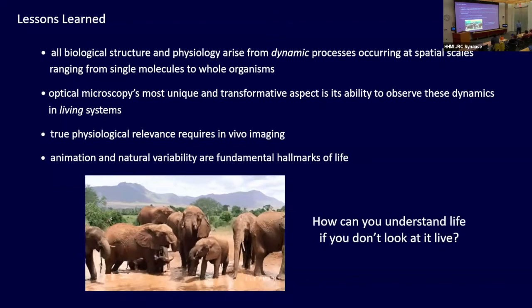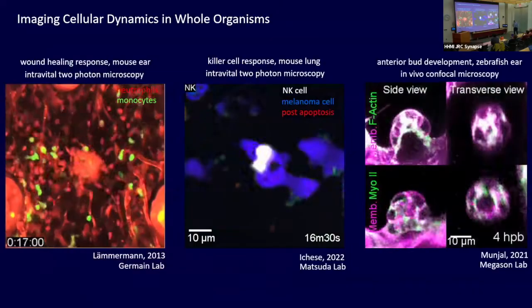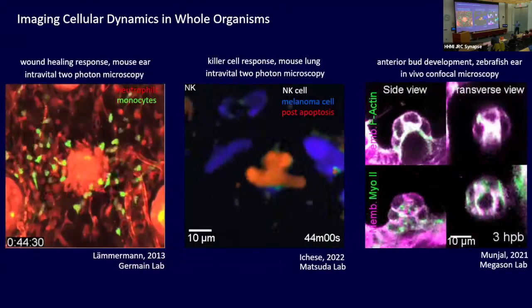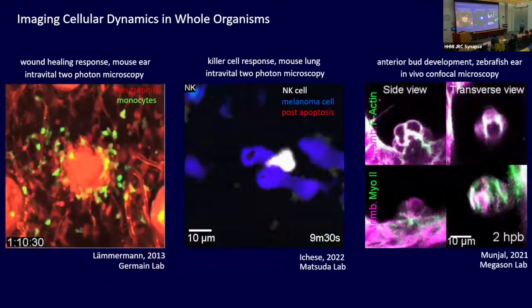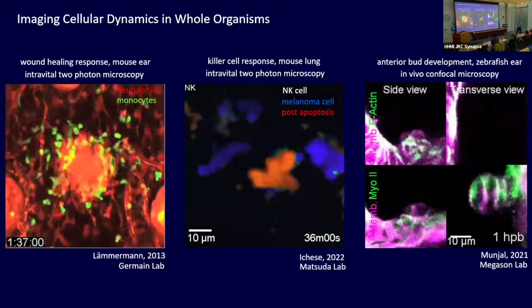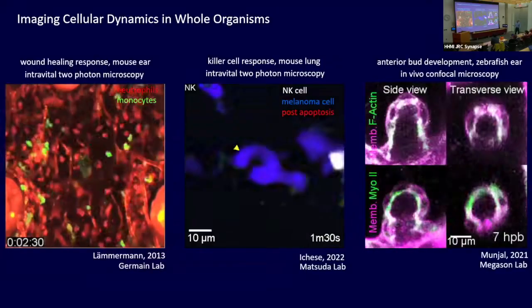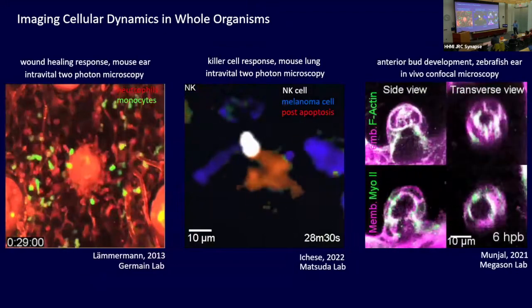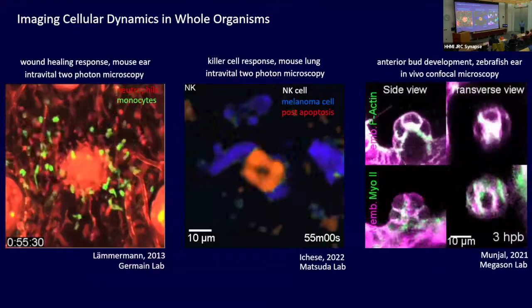final goal for optical microscopy, is to look at living systems. And in fact, optical microscopy has been used for many years to look at living systems. Furthermore, we can't just focus on looking at cells on cover slips. If I threw you naked into Antarctica, you're not going to behave the same way as you're behaving right now sitting there, right? So you need to be in the environment in which you evolved. And so people have been doing that with 2-photon and other tools that you can see here. But again, it gives you a little bit better than single cell resolution, but doesn't really give you much information about what's happening on the subcellular scale.